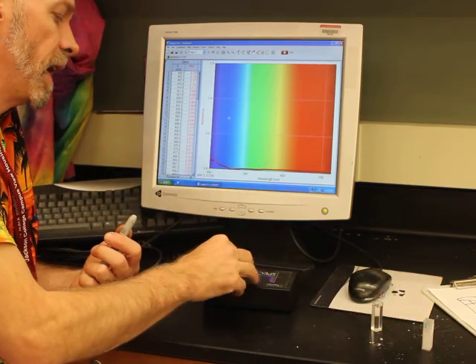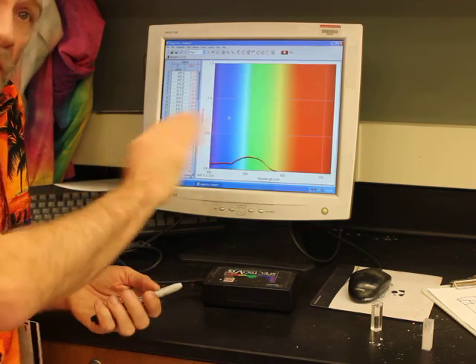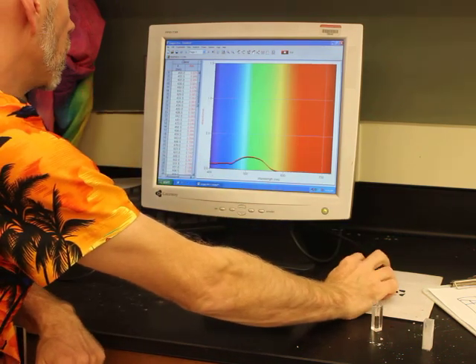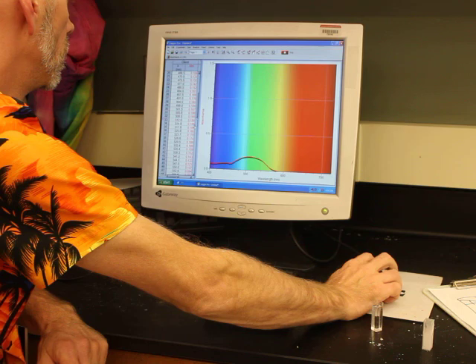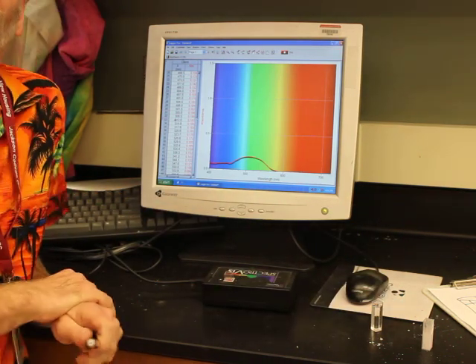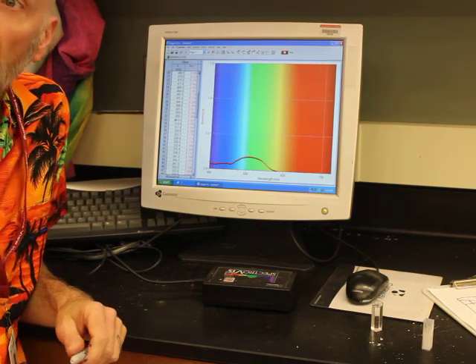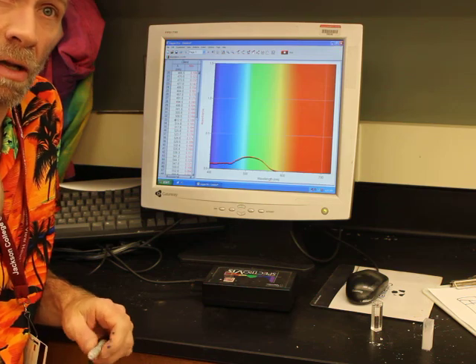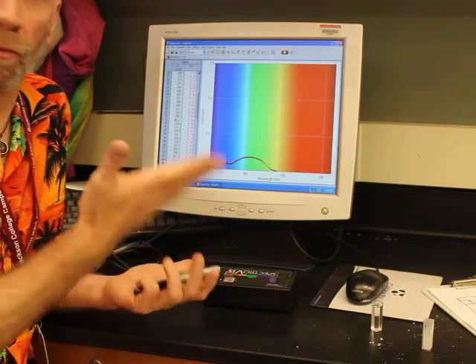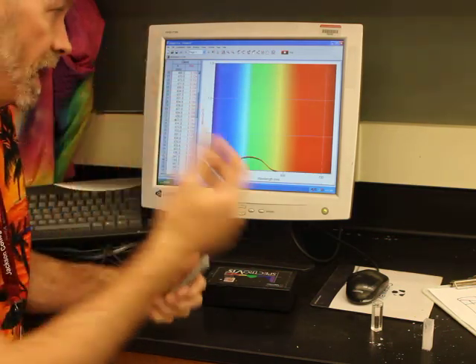Now when I come over and put in my soda sample, it's a much cleaner curve, as you can see. And now we can say, oh, okay, cool. My absorbance of my soda sample at 512 is 0.187. So that is the absorbance that we are going to start today with. We've now measured the absorbance of the pure soda sample.